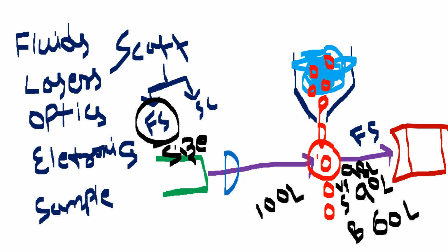So successfully now we understood how the size of the cell is counted in the flow cytometer. Now keep in mind, students, here I can count 2000 cells per second. I can count the size of 2000 cells every second. So just imagine how complicated this flow cytometer is. It will cost around 1 crore to get this flow cytometer, but it has very potential applications. Okay, so this is all about the forward scatter.